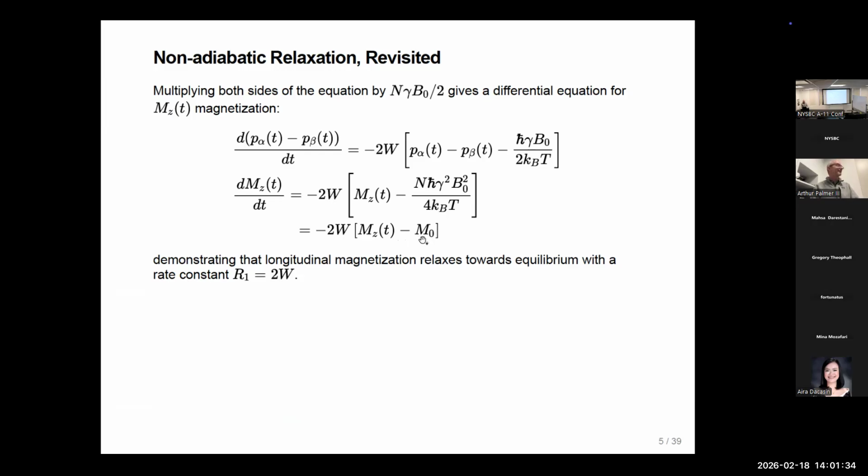Usually you think of recovery as turning the magnetization upside down and watching it recover from negative back to positive. But if I do this polarization transfer, what I'm going to see is a huge nitrogen signal that decays down to its final Boltzmann value.